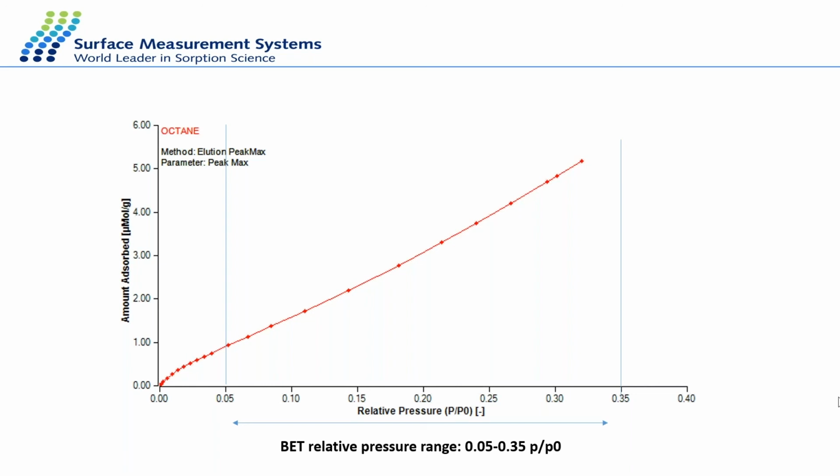In the case of our software, you also have the opportunity to change this. For example, if you measure the acetone surface tension parameters, the acid and the base, and you wish to use acetone, in the analysis software you can change the acetone or ethanol or any other polar probe's surface tension values on screen, and then you can select those probes for the surface energy calculation.